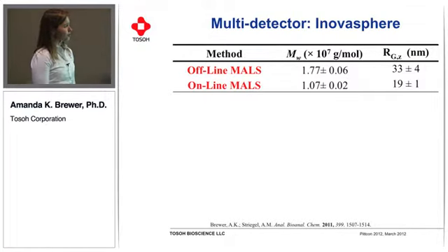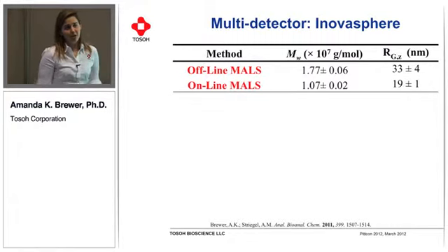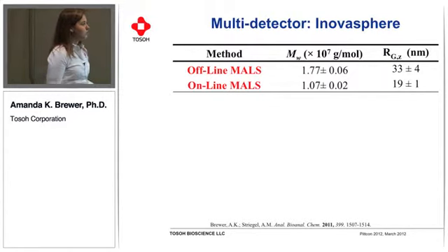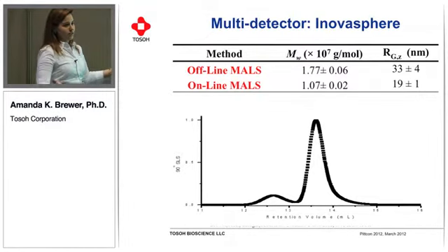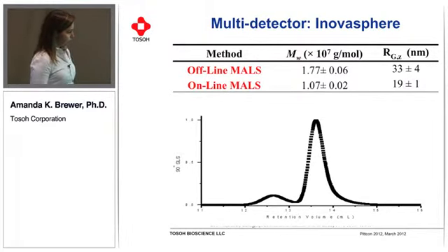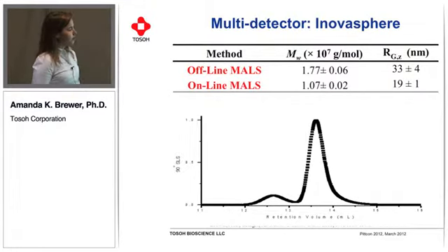So when this occurs, that brings us back to the drawing board. What is going on with our sample? The molar mass is decreasing significantly online. Changing to a lower flow rate didn't make a change, so we're probably not degrading it. So what's occurring? Well, the first thing, go back to the chromatogram. This is the bulk of why you're doing this, right? You're doing a separation. You're trying to separate the size of your molecule or particle or analyte that you're looking at. So we went back to the drawing board, to our chromatogram, the first part of information that we can obtain data from.